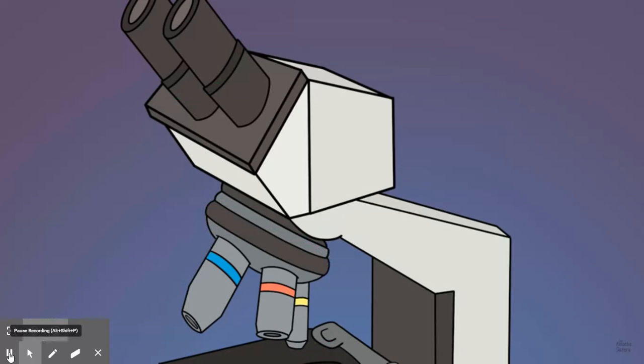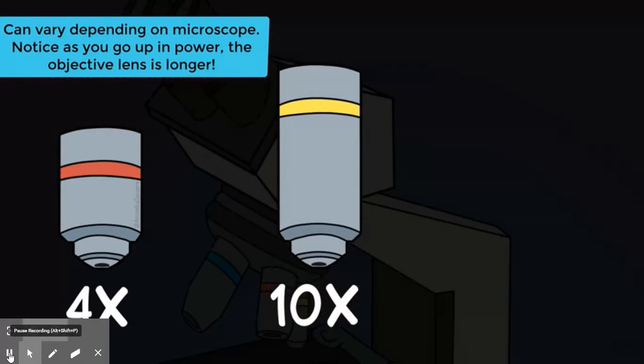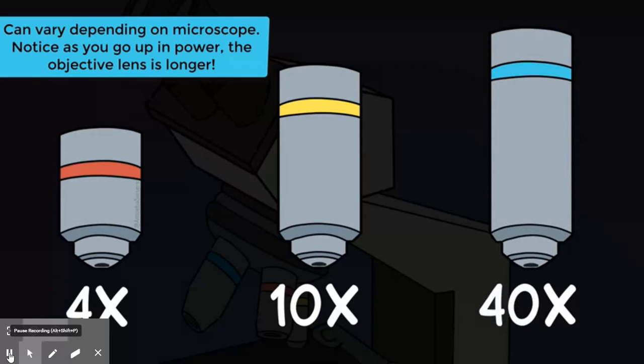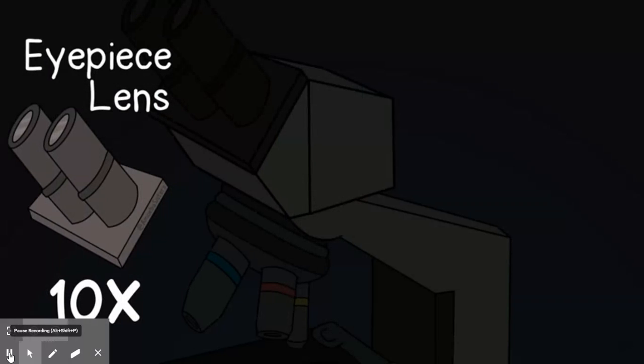With my particular microscope, I have three objective lenses. A scanning objective lens that magnifies 4 times, the low power objective lens that magnifies 10 times, and the high power objective lens which magnifies 40 times. But don't forget the eyepiece lens, because that also magnifies images. And my particular eyepiece lens magnifies 10 times.